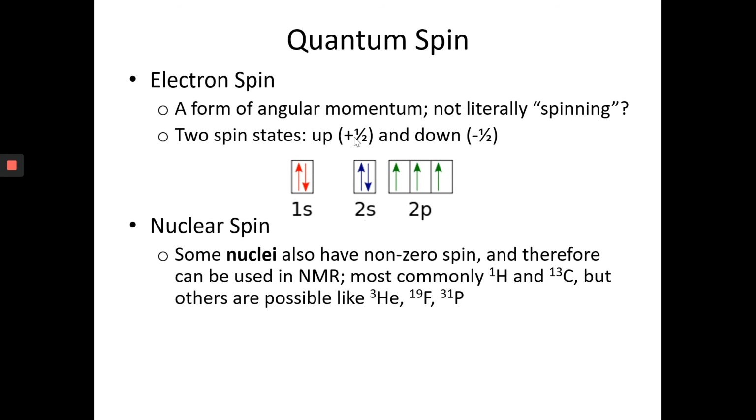We also sometimes use carbon-13. Carbon-13 is not the normal isotope for carbon. About 99.8% of all carbon is actually carbon-12, but there is a little bit of carbon-13 that's naturally occurring. Did I get that number right? It's about 1.1% carbon-13 and about 98.9% carbon-12.